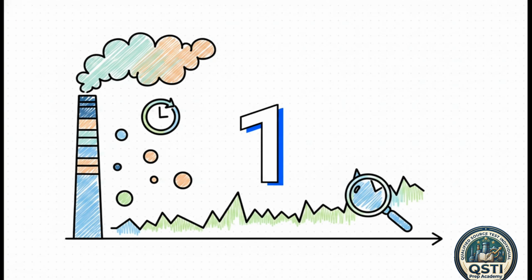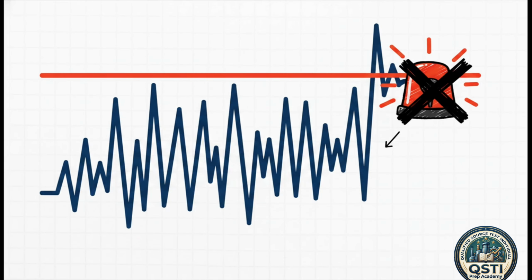Once you actually begin your test run at those traverse points, pacing is everything. You're required to record at least one valid data point per minute to stay in compliance. This ensures you're continuously monitoring any fluctuations in the effluent gas, giving you a highly granular picture of what is actually leaving that stack over the duration of the test. And there is an absolute limit you cannot cross. We call this the golden rule of Method 7E.